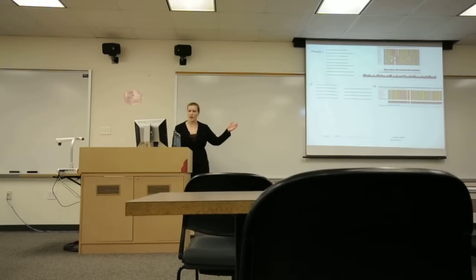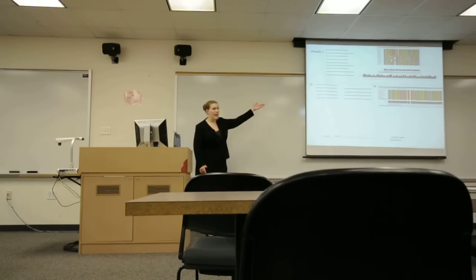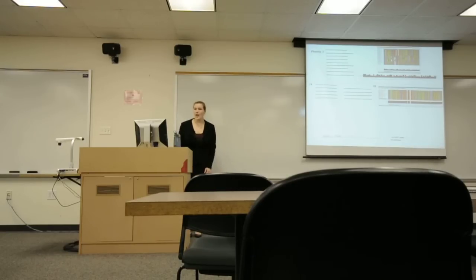So if you took family 7 and subdivided it into 7A and 7B, you can see the output for 7A is much more even. The consensus sequence as compared to the one above is much more even, and you're much more likely to allow targets to hybridize to probes if the sequence is as representative.